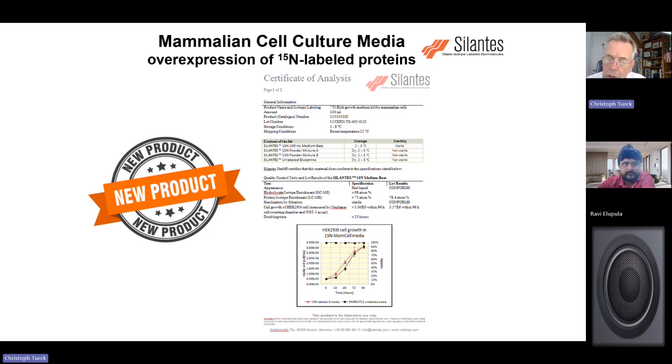So that's something you don't want to use for relative quantification purposes. But what you can do, of course, is take tissues from different developmental stages of the mouse, and then use the adult mouse, the developed mouse reference material, for the relative quantification purposes. Yes, that's the way I would go about it.